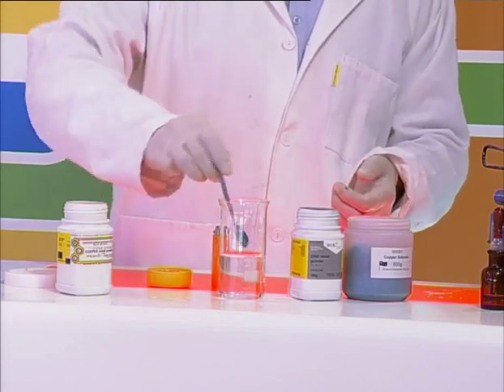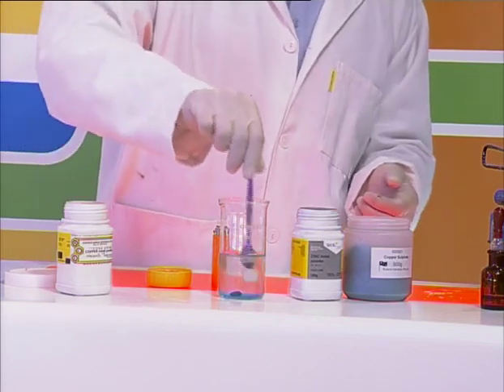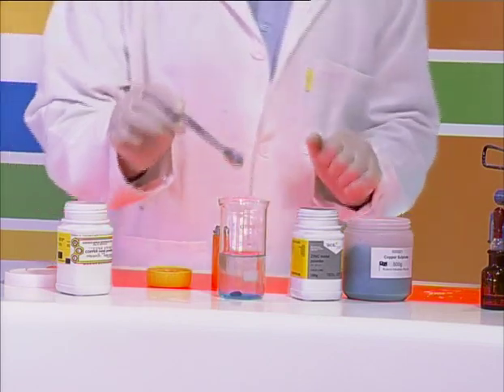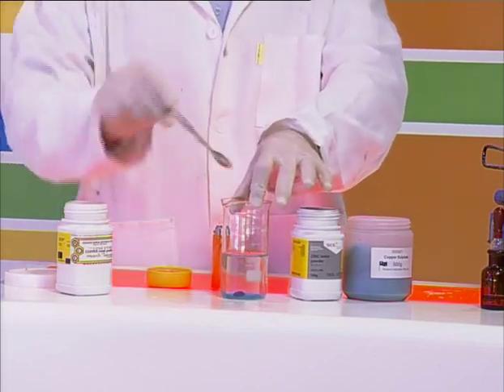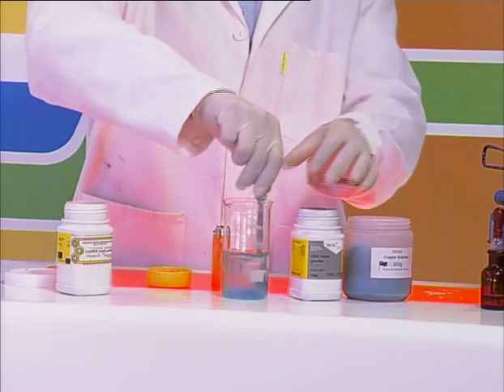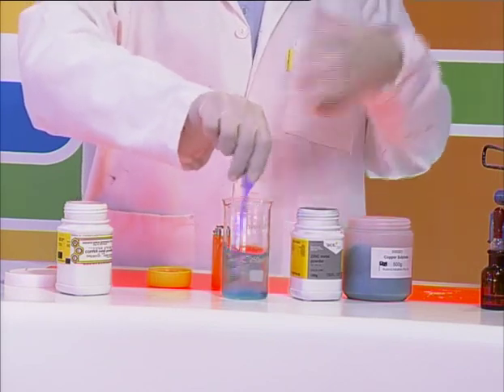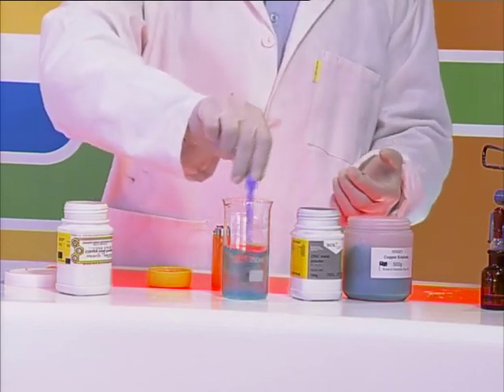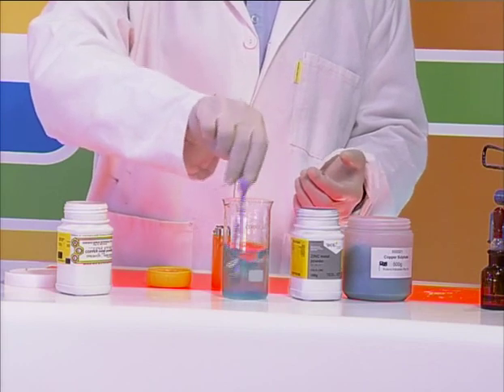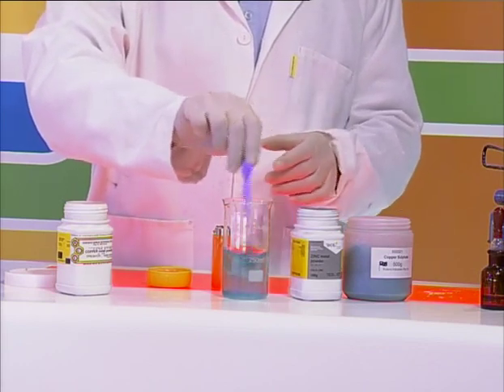When I put them inside the water, I start to notice something quite interesting. Now, this is one of those few experiments where you can actually see something happening. So I see this blue color, and its blue color is slowly making its way through the beaker. And as I actually stir this, I'm dissolving the blue crystals. I'm allowing the copper 2+ and the sulfate ions to go their separate ways. I'm freeing them to move around and react when we do react them. Now, this is just another one of those chemical precautions.